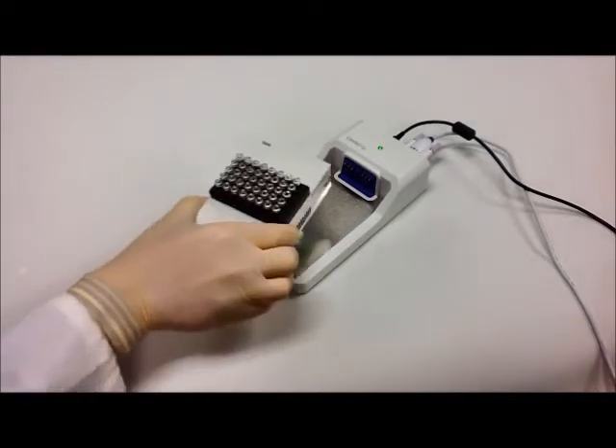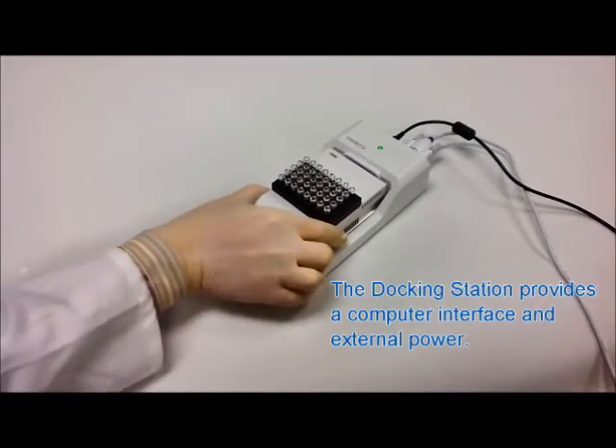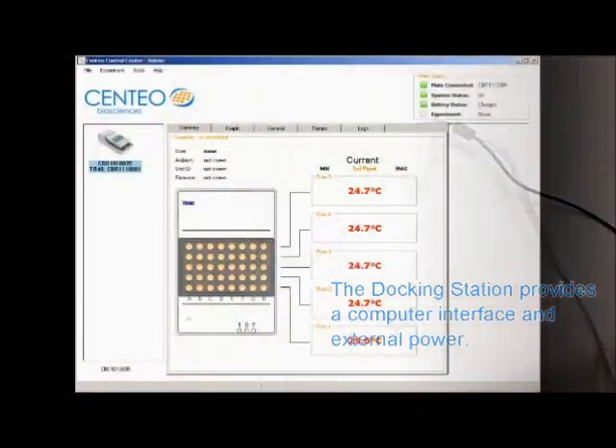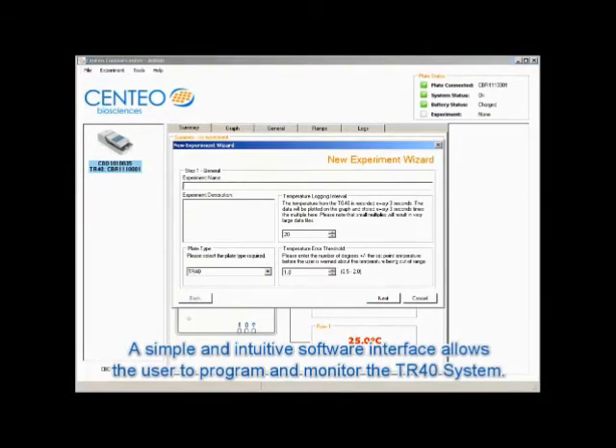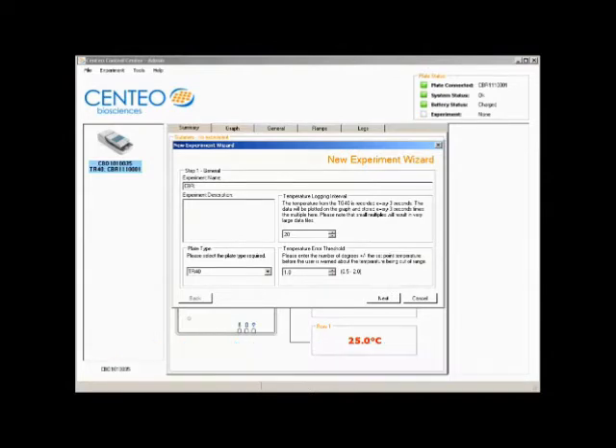The microplate can operate remote from the docking station, but when docked the microplate can be controlled from the PC and its battery can be recharged. The Centeo software provides a simple and intuitive interface to set, control and monitor the temperature in each row.